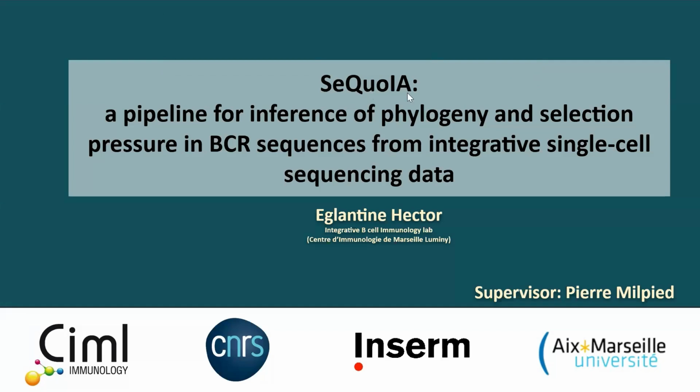Okay, so hi everyone. So today I'm going to present the pipeline for BCR sequencing SeQuoIA that I have been implementing during my PhD.